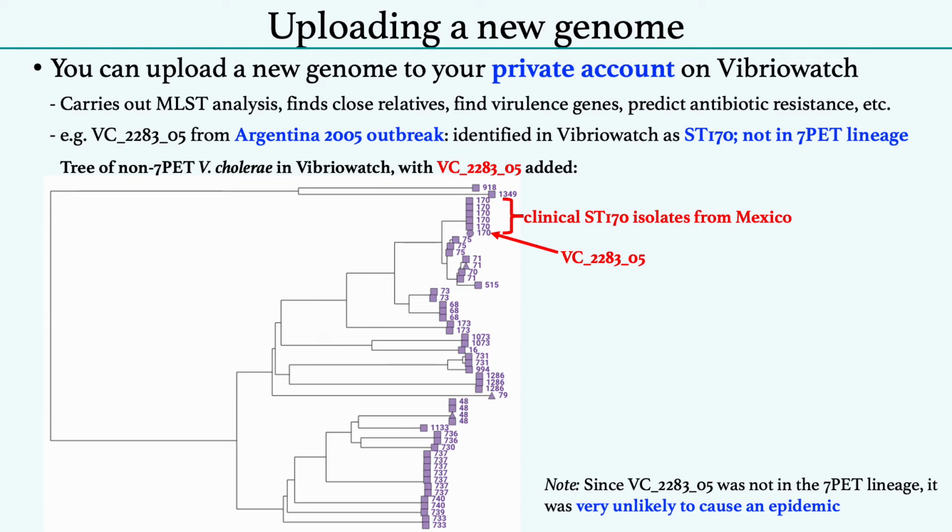You can carry out all the analyses that I have described so far, including MLST analysis, finding close relatives using core genome MLST, finding virulence genes, predicting antibiotic resistance, producing phylogenetic trees, and so on.